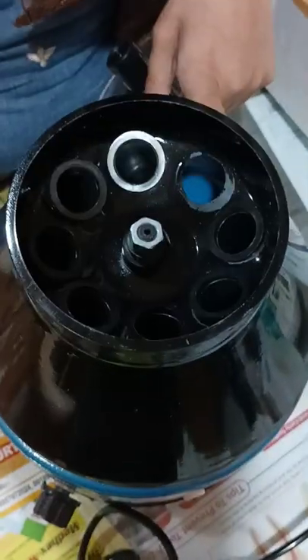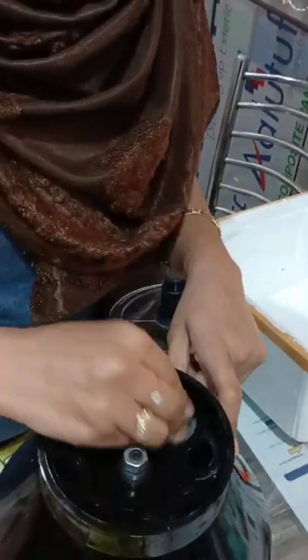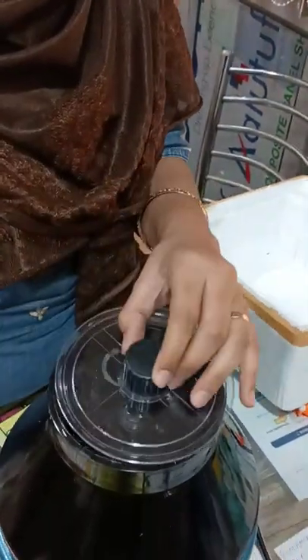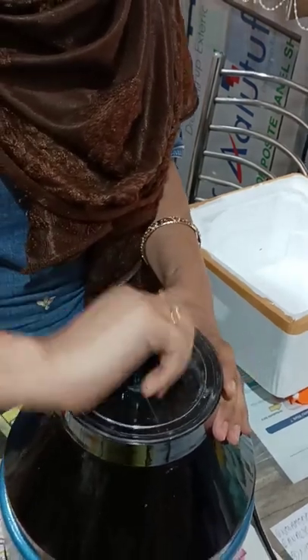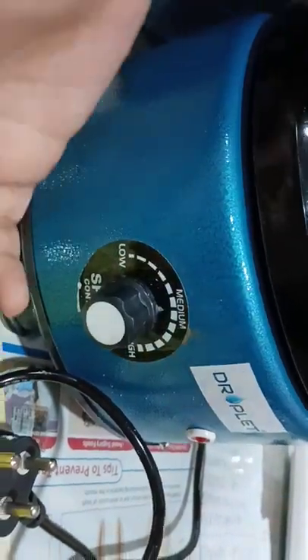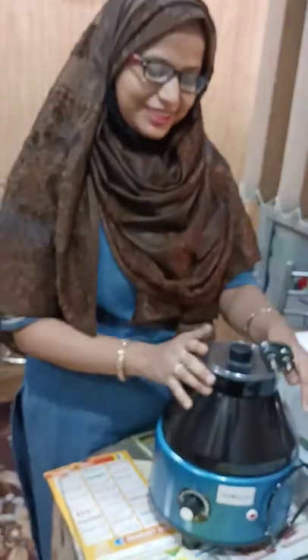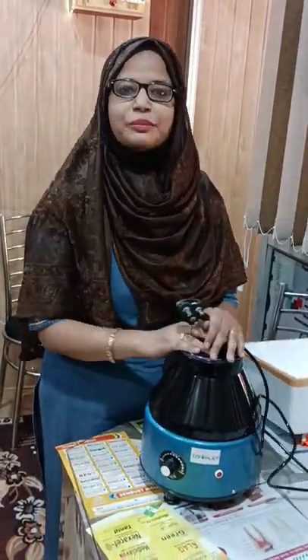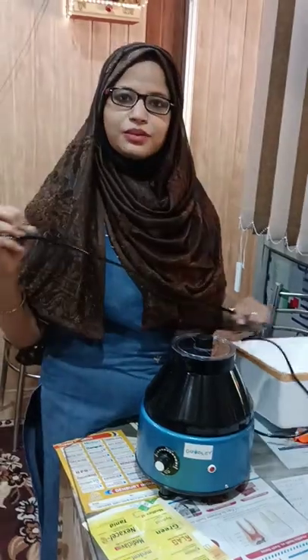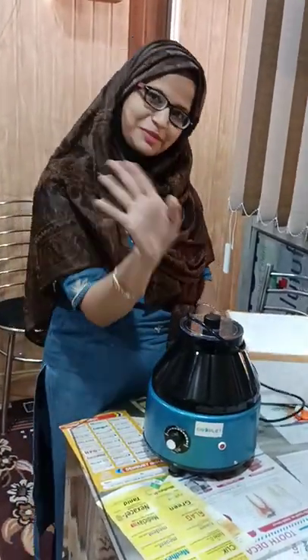We have test tube holders — you put blood in a glass test tube, then put the test tube inside this, close it, and put it on the machine. You set it at a desired RPM depending on whether you're making PRF or PRP. So that is how it works. We'll make PRF and shoot a video while we do it, so until then, bye!